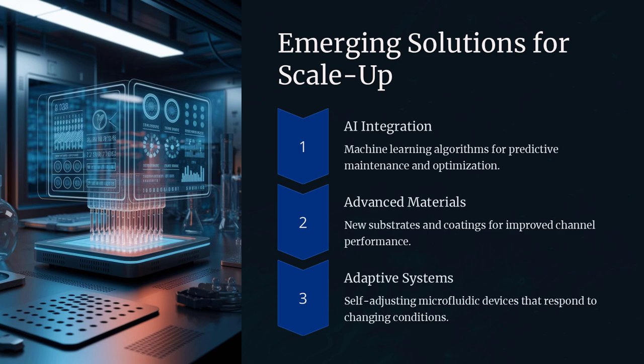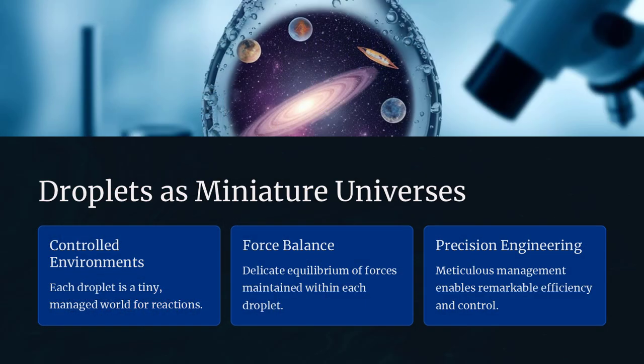When asked what potential issues might arise if an inappropriate surfactant is used, the answer is that a mismatched surfactant can lead to toxic byproducts, inadequate reduction of interfacial tension, and ultimately droplet instability that compromises the entire process.